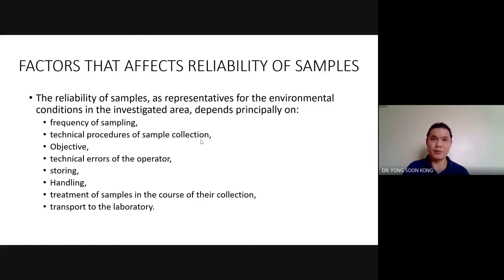These two methods are accepted, but why do I choose CEC by sodium acetate? Because I'm not a farmer. I have no interest in what nutrients are contained in the soil. Eventually both methods can answer what I want to know, CEC. But I don't need to go through all the hassle of leaching and calculating each cation one by one. All I need to do is use the sodium acetate method and there I go. I know the CEC, because my focus is just to know how much cation a soil can absorb.